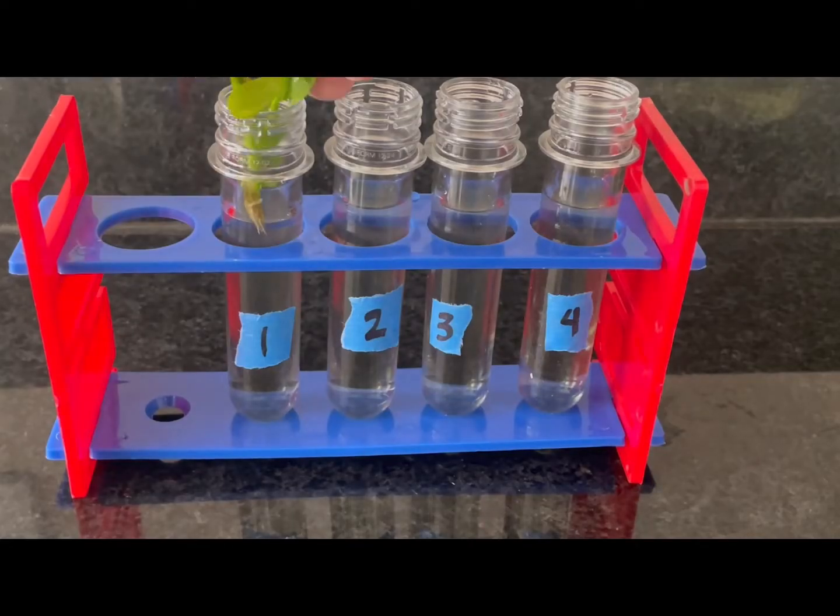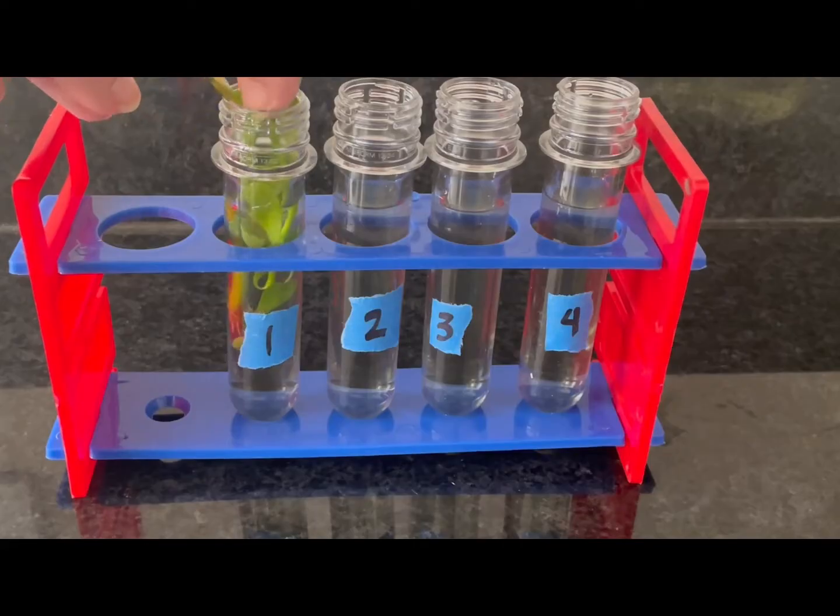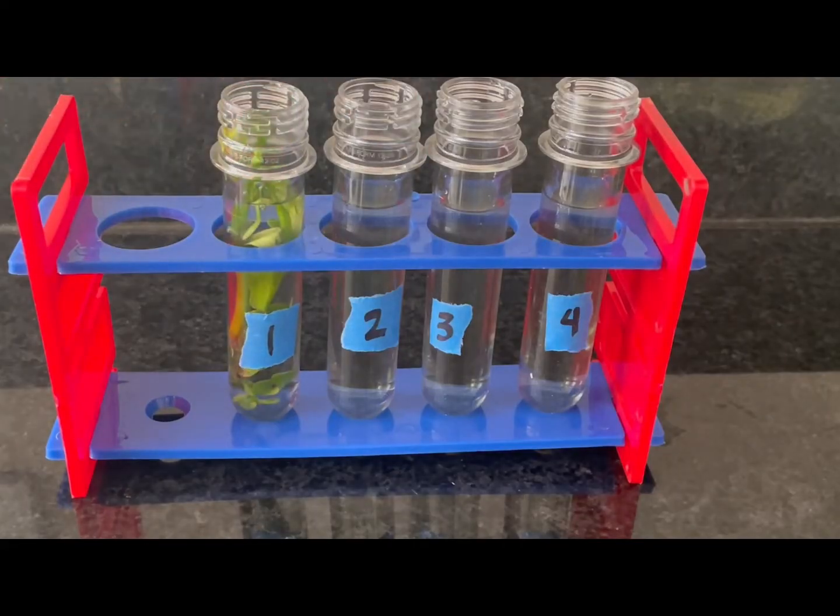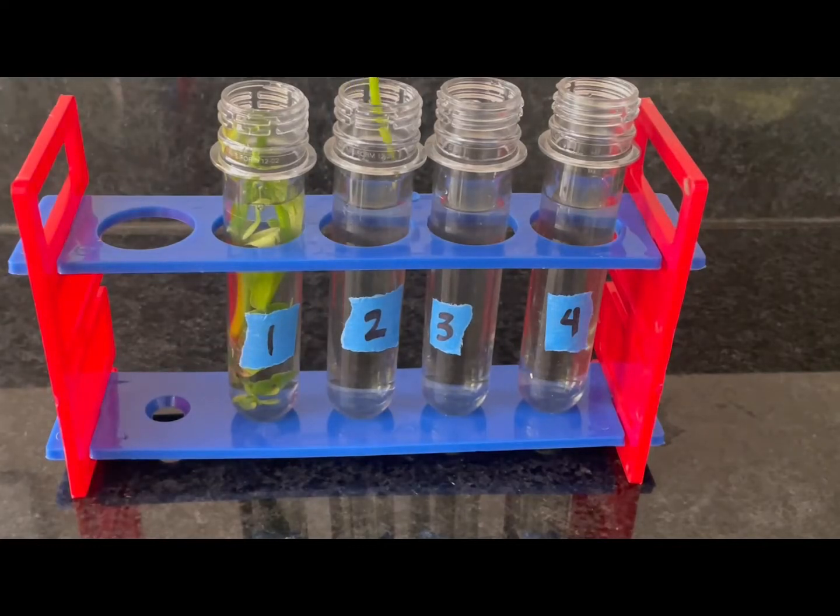Then you're going to add an aquatic plant to the first two test tubes. The last two test tubes will be the control without plants.